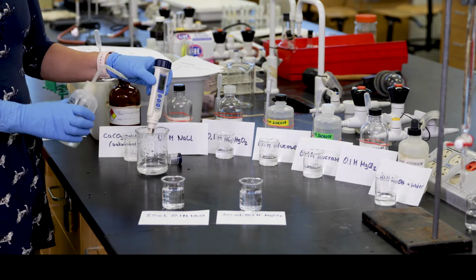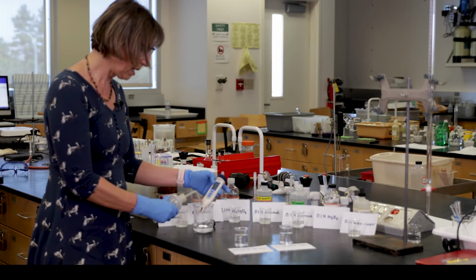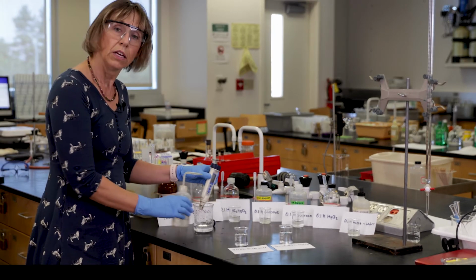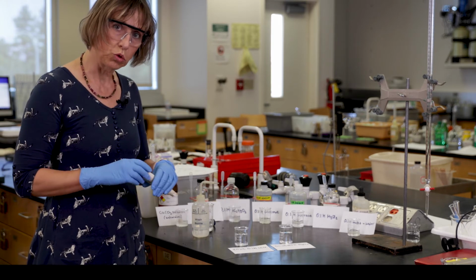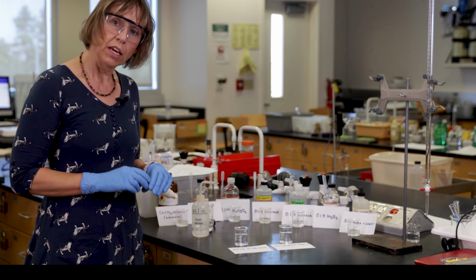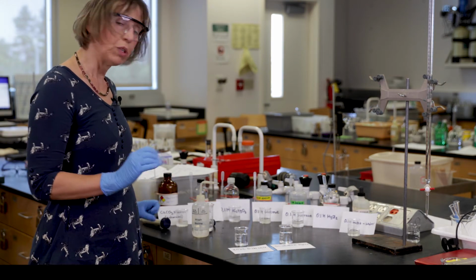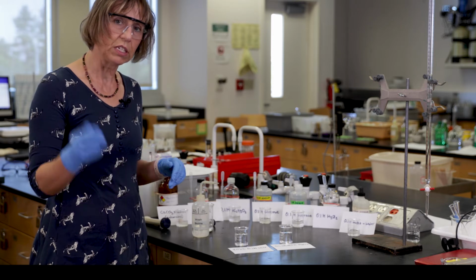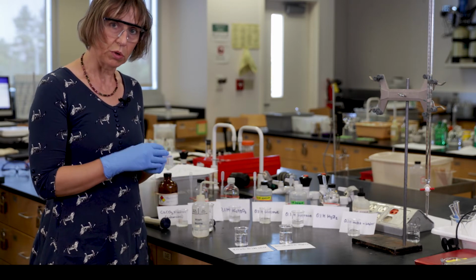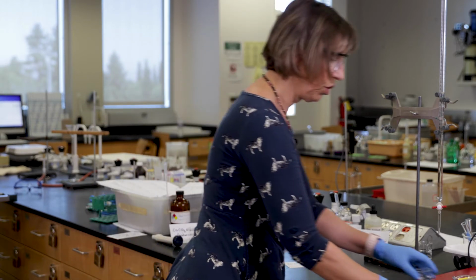Great. So you want to go to part B and fill in that table with the data you just saw, and there are some calculations you want to do for that measurement. In part C, we do a dilution and measure the conductivity as it changes when we add more and more water.